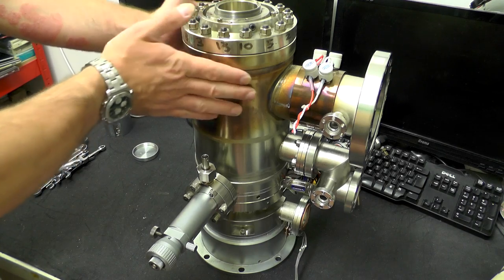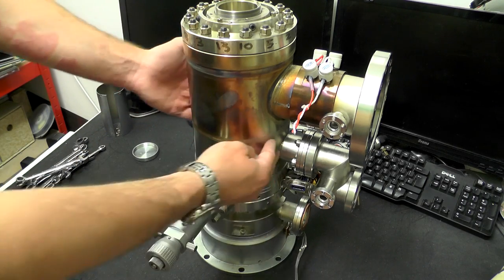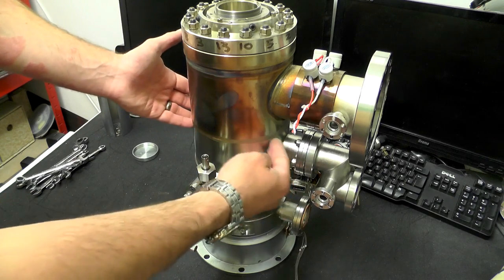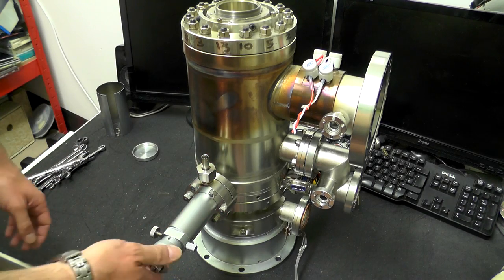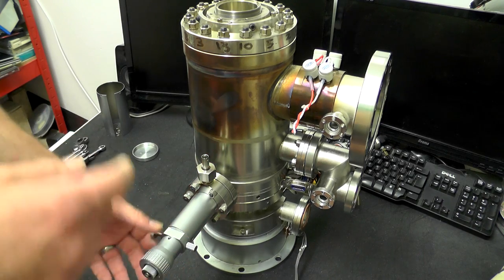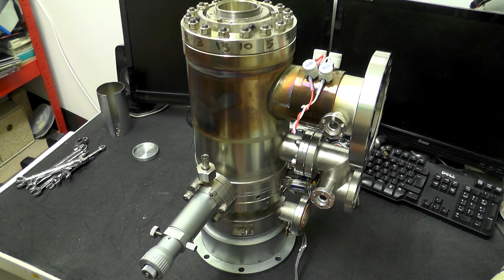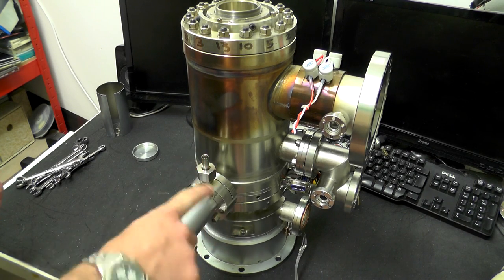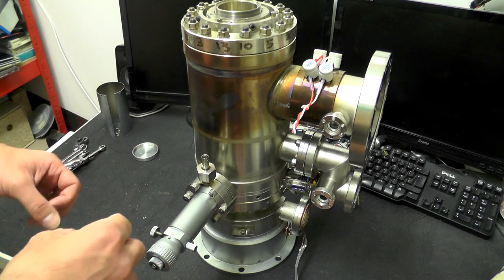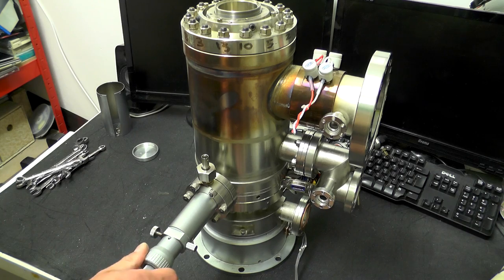I believe this is essentially divided up into three sections: we have the electron gun section, then what will be the first focusing coil lens. That is separated by this here, which is going to be a beam aperture control — similar to the one on the base of the column attached to the sample chamber. I believe this just inserts a small element in and out of the beam, allowing you to change the size of the beam — essentially an aperture moved in front of the beam.